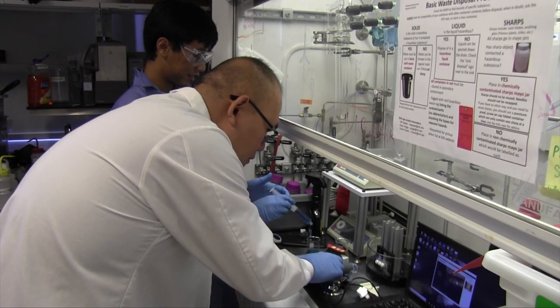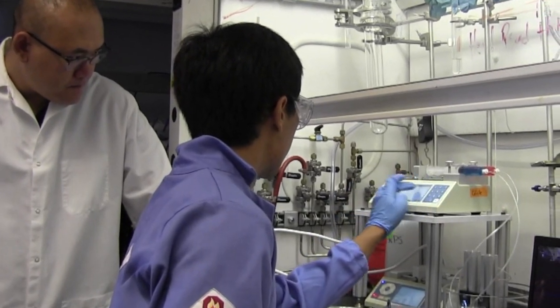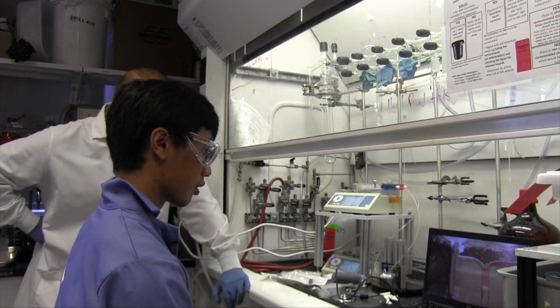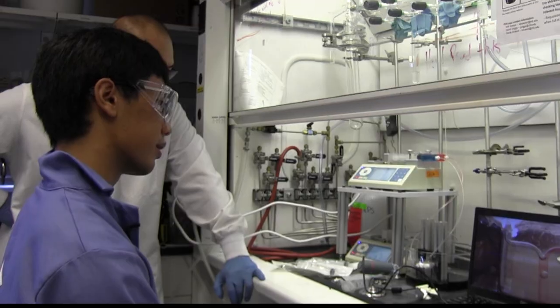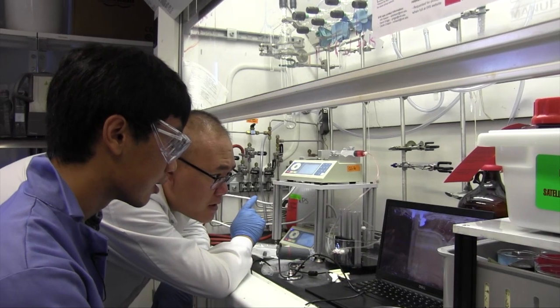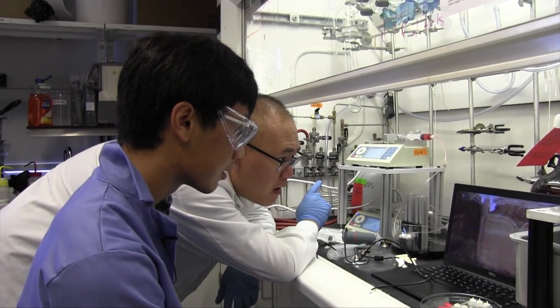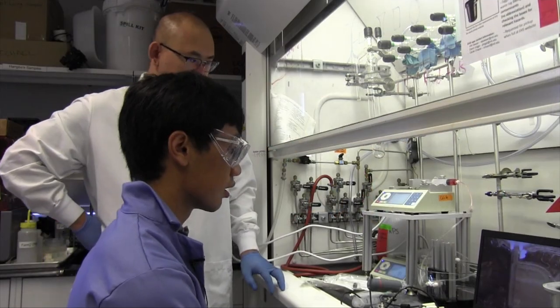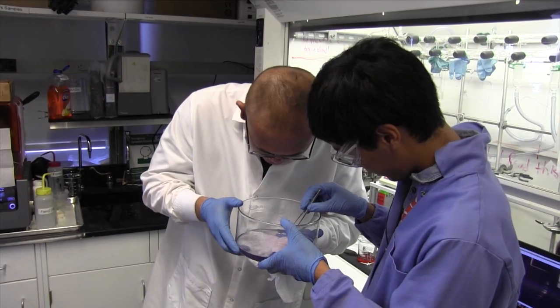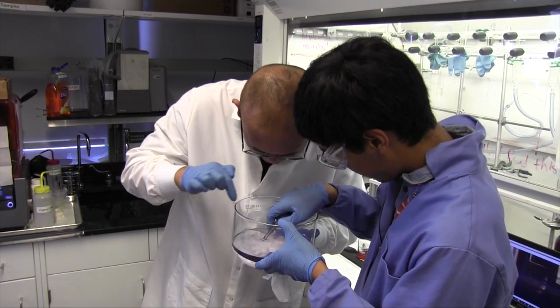The thing we learned from last time is we change the flow rate. Start with 2, maybe. That's good. Let's start this one. It's just some bubble, I think, that's trapped in there. Seems like there's a laminate flow going on right now. Yeah. We just couldn't see the interface that well. Let's stop. See? I just need some polymers inside. Do you see it? Yeah, there's little strands of polymer.